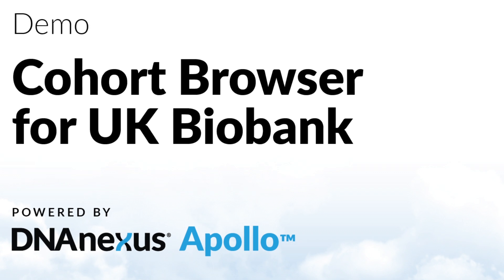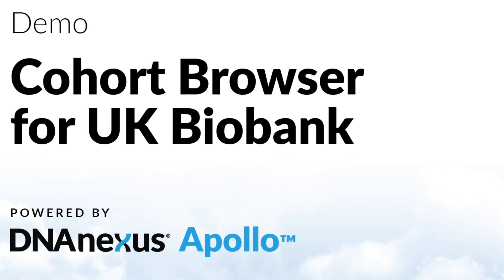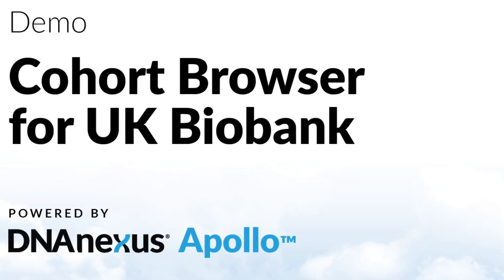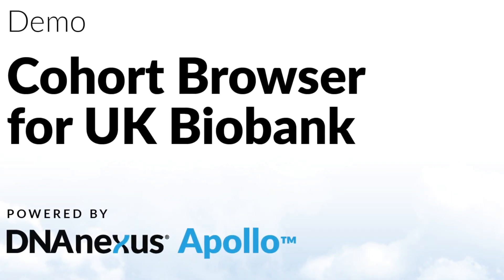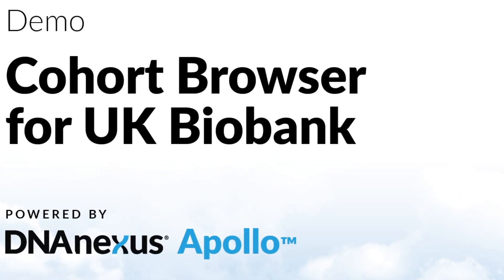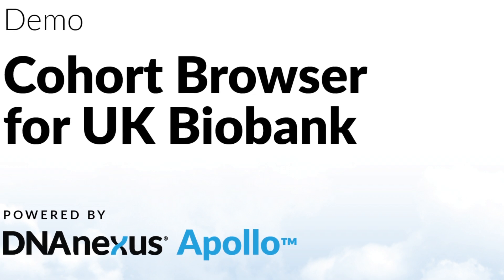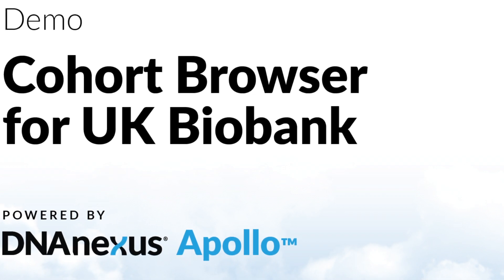Here we've loaded some synthetic UK Biobank data to the browser to demonstrate how it works on a large collection of linked genomic and phenotypic data.